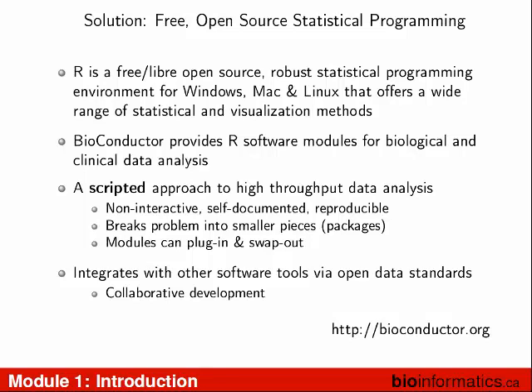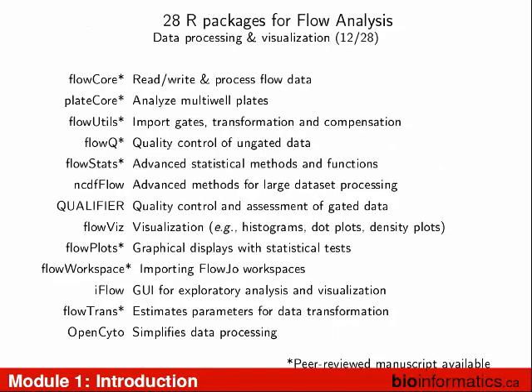So this has been developed. We've done a lot of development, but a lot of other people have done development in this area as well. And it all works because it's all open source. All these tools work together. It's fantastic. So bioconductor.org to find more information about that. So, lots of software out there for doing data analysis in R. We're not going to talk about all those. The first one that's probably the most important just to get stuff going is flowCore.